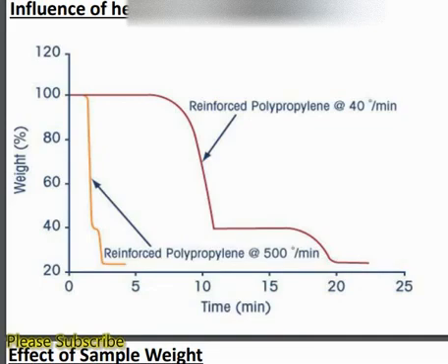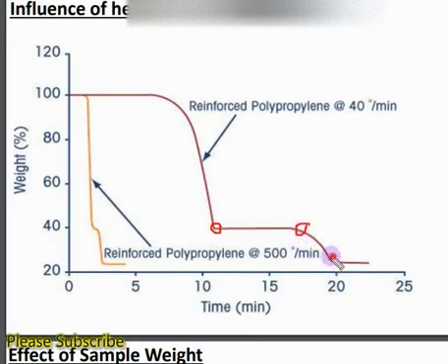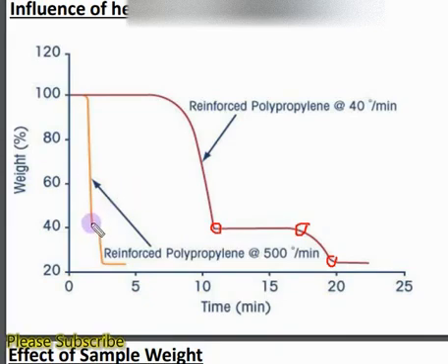Heating rate also influences the resolution of TGA curves. If the heating rate is slower, thermal equilibrium will be maintained and we get well-resolved peaks, because greater time is available for the thermal event. We get a clear and well-defined TGA curve with sharp corners and an exact temperature for the start and end of the event. However, if the heating rate is very high — for example 500°C per minute — the peaks are not well resolved and we are unable to identify the difference between thermal events.